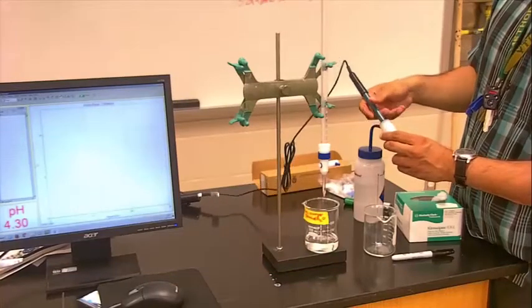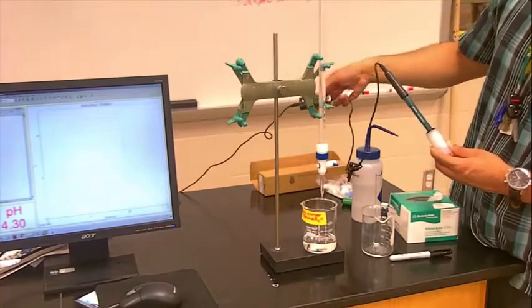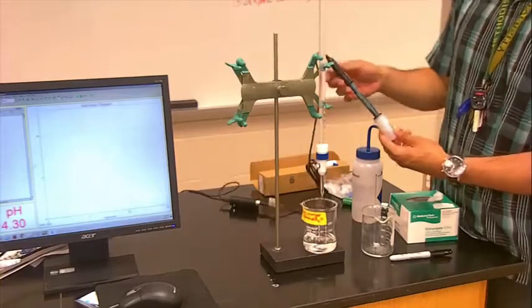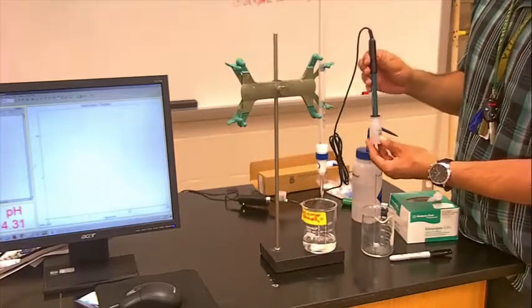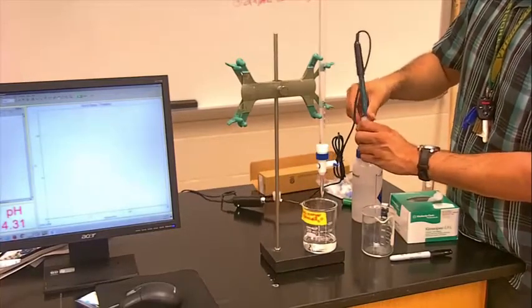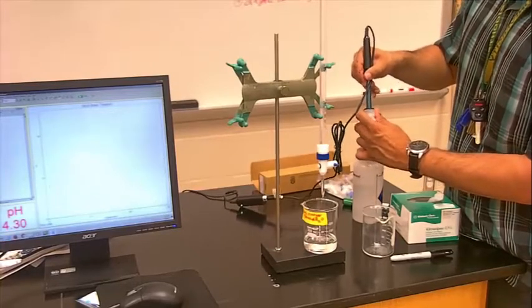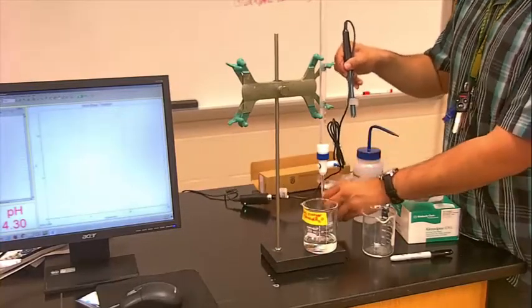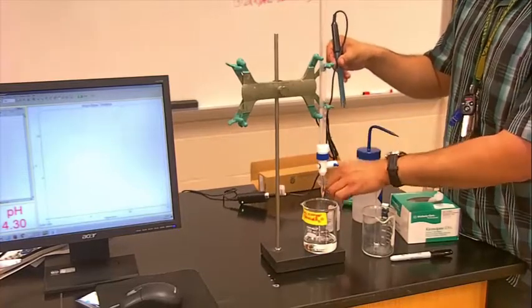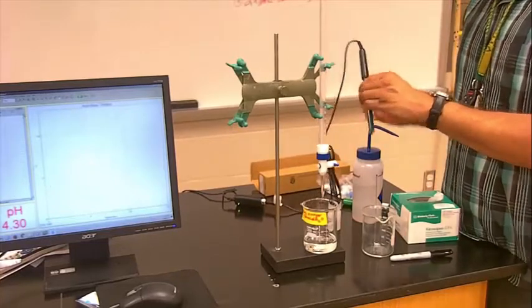All right, here is your pH probe. It's going to be connected to your computer via this GoLink adapter. And it's already stored in electrode solution. So just rotate that cap off. You don't want these to dry. Now, it's up to you if you want to keep that cap on or take it off, but minimize drying time. Always keep this probe wet.